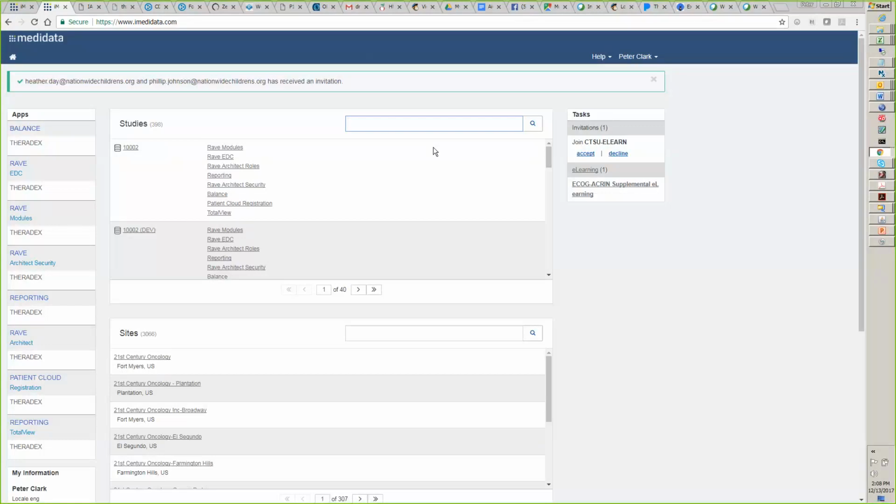I'm going to log into Rave with two different roles. So getting right down to it, both of you will need to have Rave accounts if you don't already, and I can orchestrate that for you either later today or tomorrow. All of the data entry for the ETCTN protocols is carried out in the Rave EDC environment. And right now, the screen you're looking at, and I assume you can both see my screen? Yes. Yep. Very good.